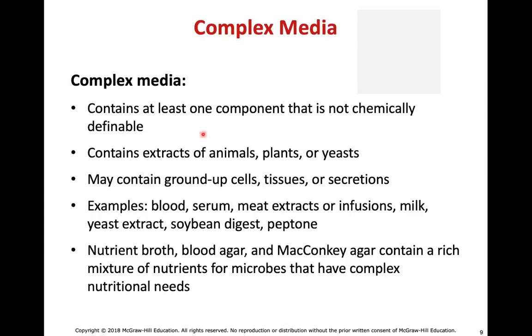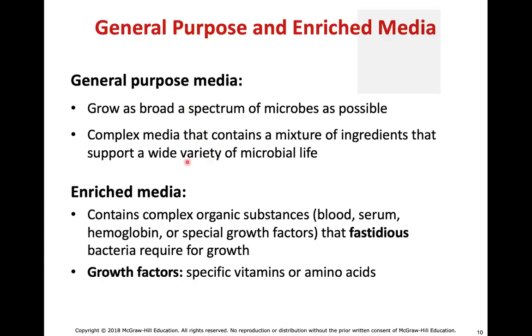And obviously you can imagine cost-wise, defined media is going to be a lot more expensive. So we typically use complex media for just generally growing up microorganisms. It's usually very nutrient rich. I'm sorry, it doesn't have a lot of microorganisms present. It has a lot of nutrients present, which will allow a lot of different microorganisms to grow up. So those are the two main types of media, and there are many subdivisions within those two types of media.